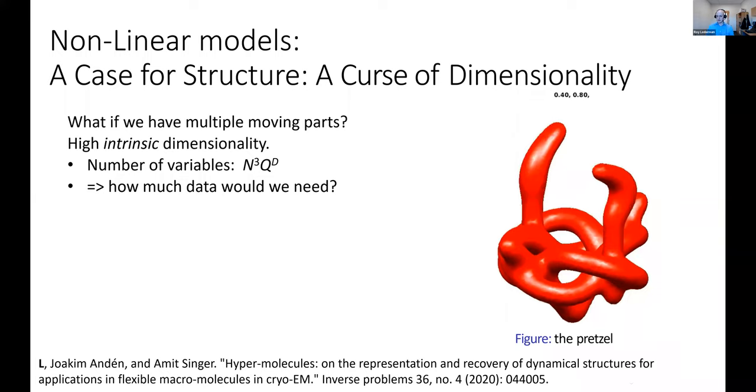this doesn't sound practical. For experiments with something a little more complicated than the pretzel, we did have things that are 15 dimensional, and there's no way we have enough data to fit this. A million images are just not enough for this. So what do you do? You need some structure.